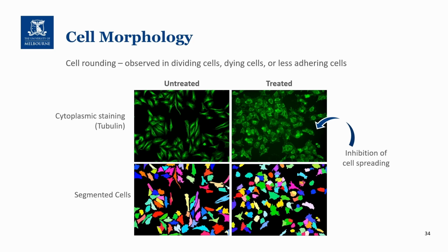Using this fluorescent channel, it is relatively simple to detect individual cell bodies using an Operetta analysis sequence. And you can see here that in this example, the seeding density is appropriate for the measurements we want to make, as there aren't too many cells and it's possible to perform accurate cell segmentation.